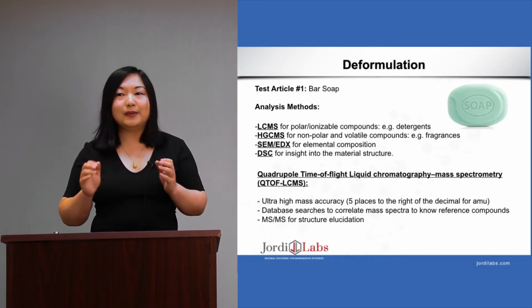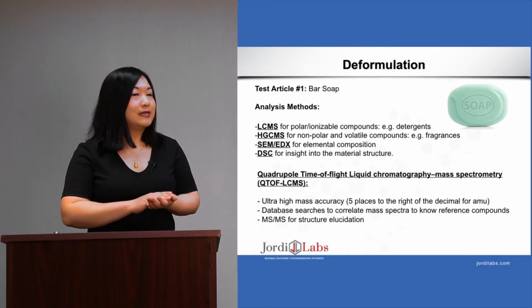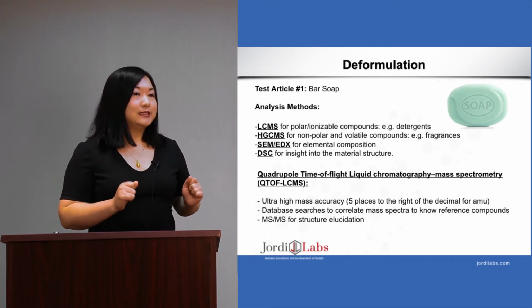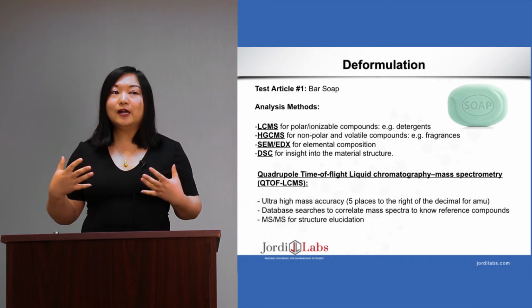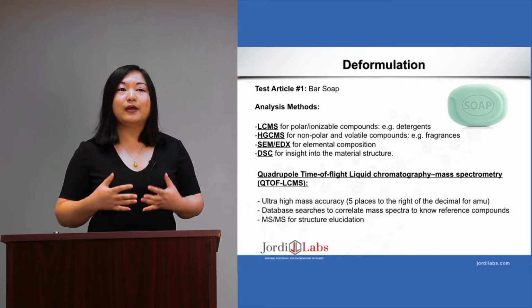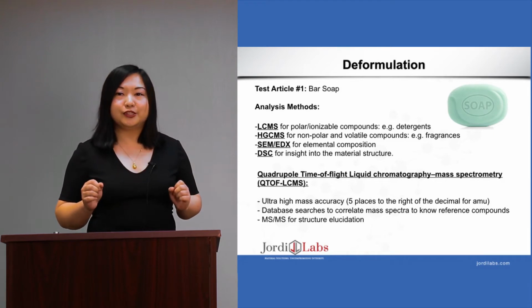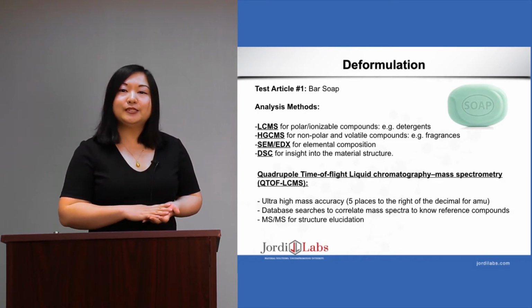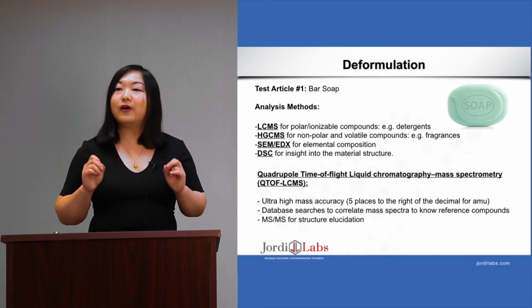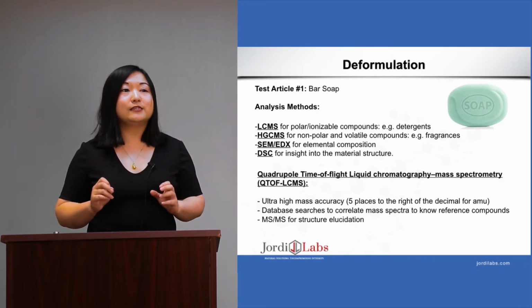The techniques we picked here include LCMS, GCMS, EDX, and DSC. As I mentioned earlier, LCMS is used to analyze the ionizable and polar compounds, such as detergents. And headspace GCMS is particularly good for the detection of volatile compounds, such as fragrance.